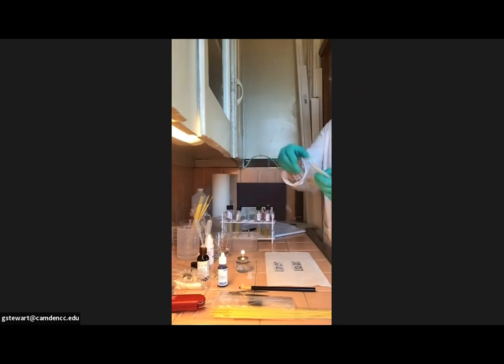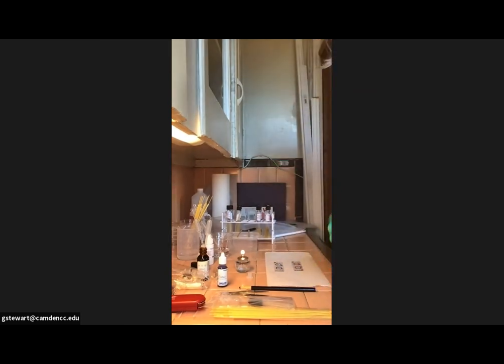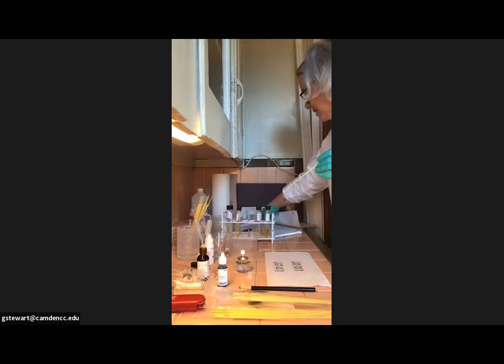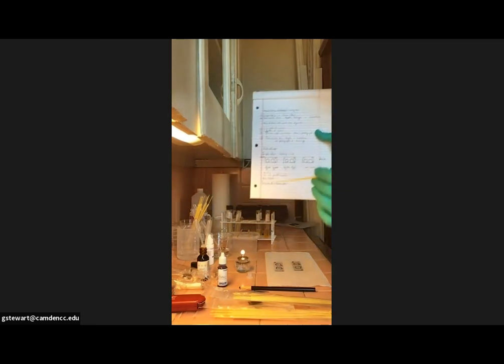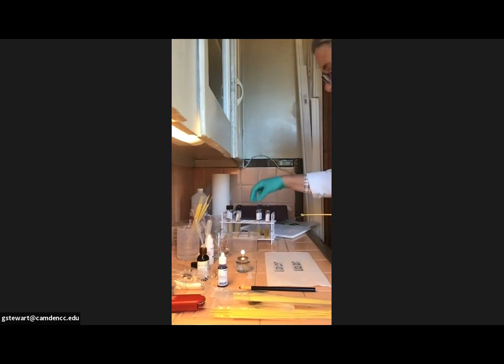I'm going to try to get one inoculating loop all by itself, close to the surface, close to the Ziploc tab, so that I can open this very carefully and withdraw a single loop. I've already made notes, a reminder to myself of what the order is going to be on each of my slides. Slide number 1, circle A, I believe it needs to be E. coli.